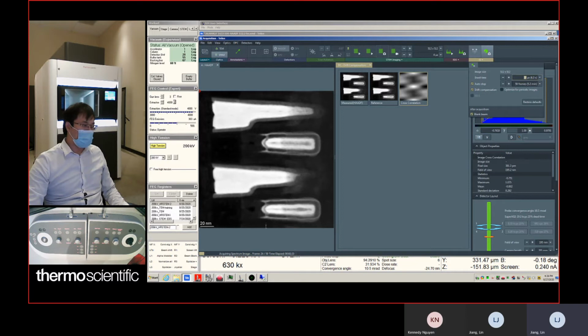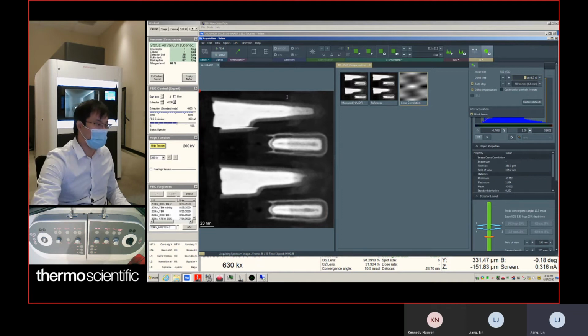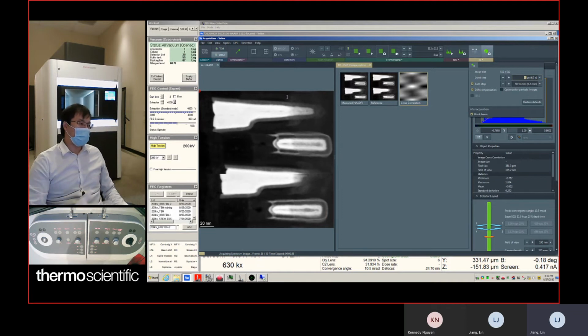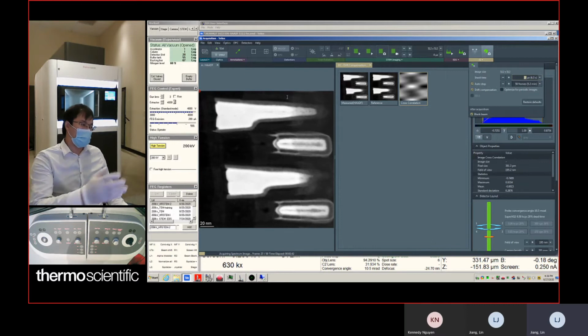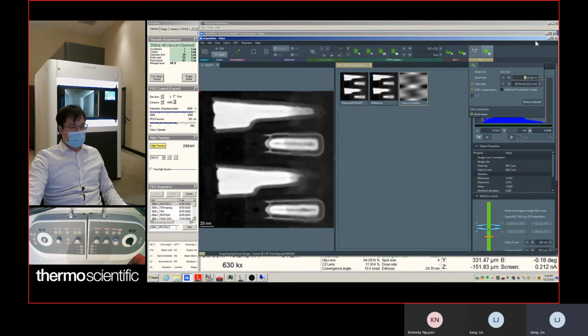If you move when it's at the top, then it's probably 3 seconds to bring it back. If you move right after the correction, it takes up to 6 seconds to bring it back. So that's the effect of the dwell time on drift correction.